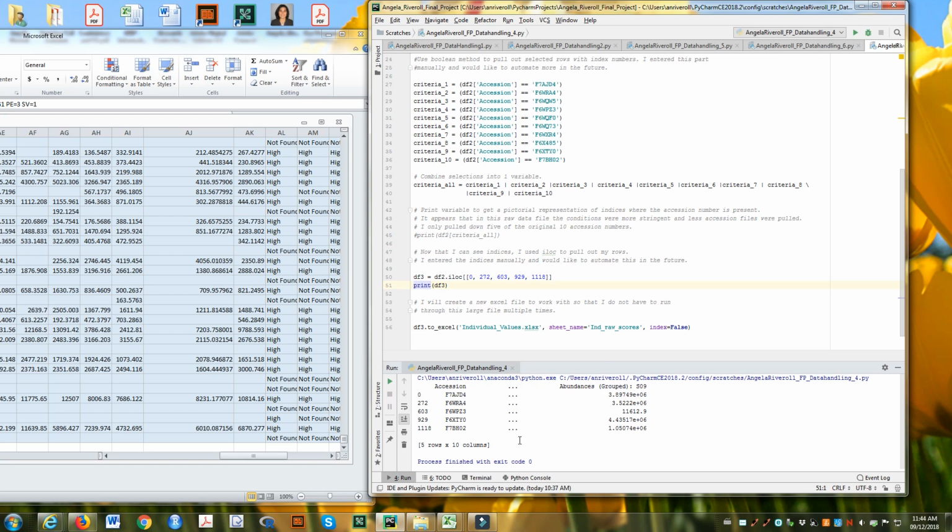So now that I had this data, I could run my ANOVA. I had to transform my data because the way the ANOVA works, it requires that the control and the various groups be put as rows instead of as columns.